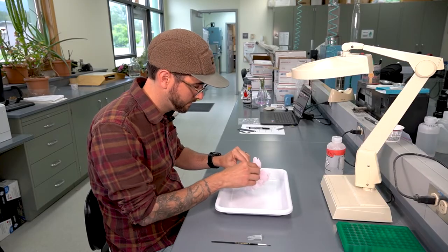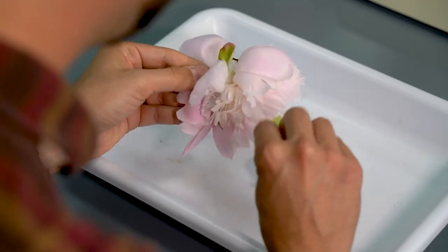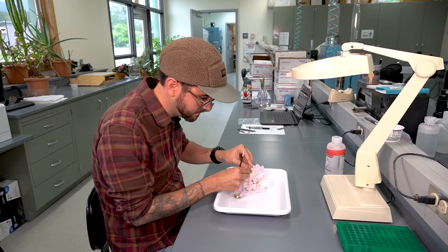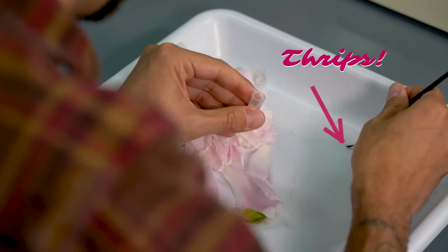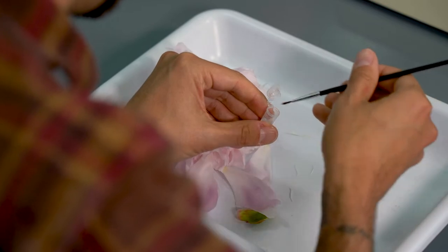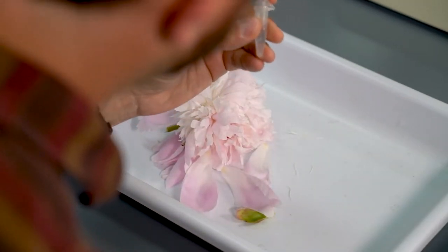For each peony bud, I carefully dissected them, pulling apart all of the leaves and the petals to find the thrips that were hiding inside. Information was recorded on the type of cultivar for the peony, which region it was grown in, and how many adults and larval thrips I found inside.